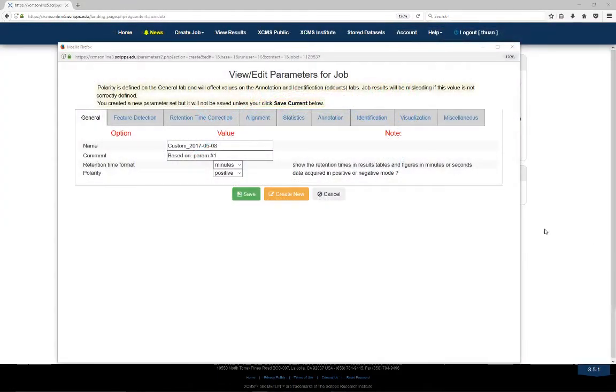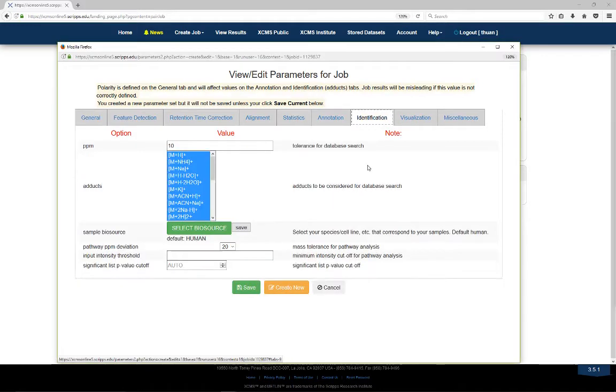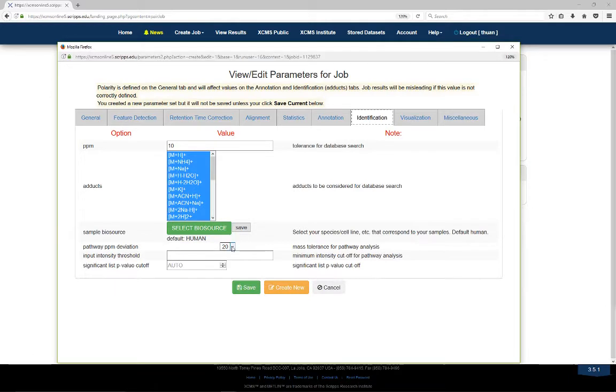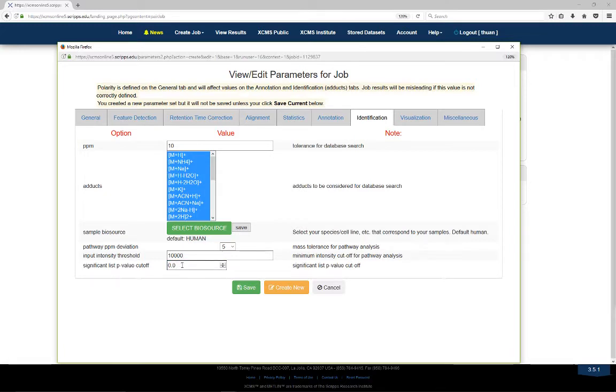Several parameters need to be properly defined in the parameter settings for its reliable performance. This includes the correct biological species, a mass tolerance for the m/z matching in pathway analysis, an intensity threshold to exclude low abundance peaks from the analysis, and a p-value cutoff to extract statistically significant metabolic features for the predictive pathway analysis.